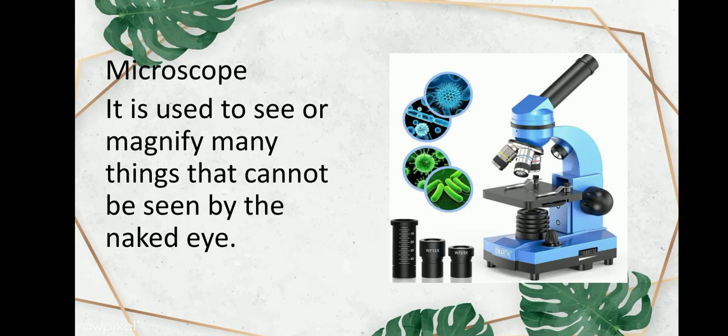The microscope is an important investigative tool used for studying objects and organisms around us. Microorganisms like bacteria can be observed through the use of a microscope. Compound microscope is the most common type of microscope. Now, let's talk about the parts and function of microscope and how it really works.